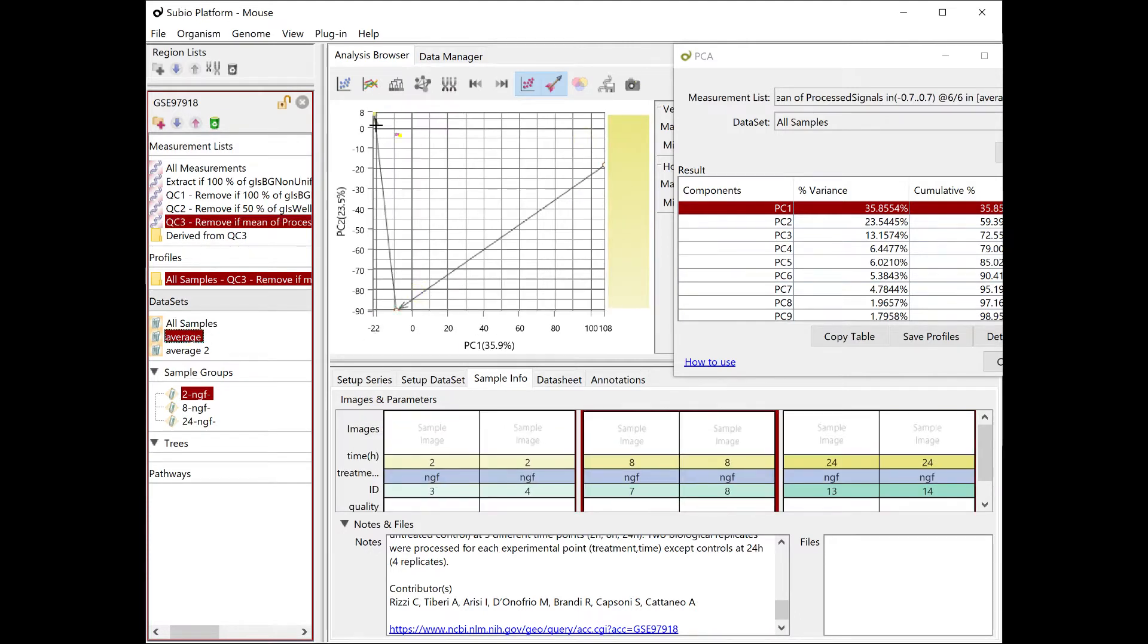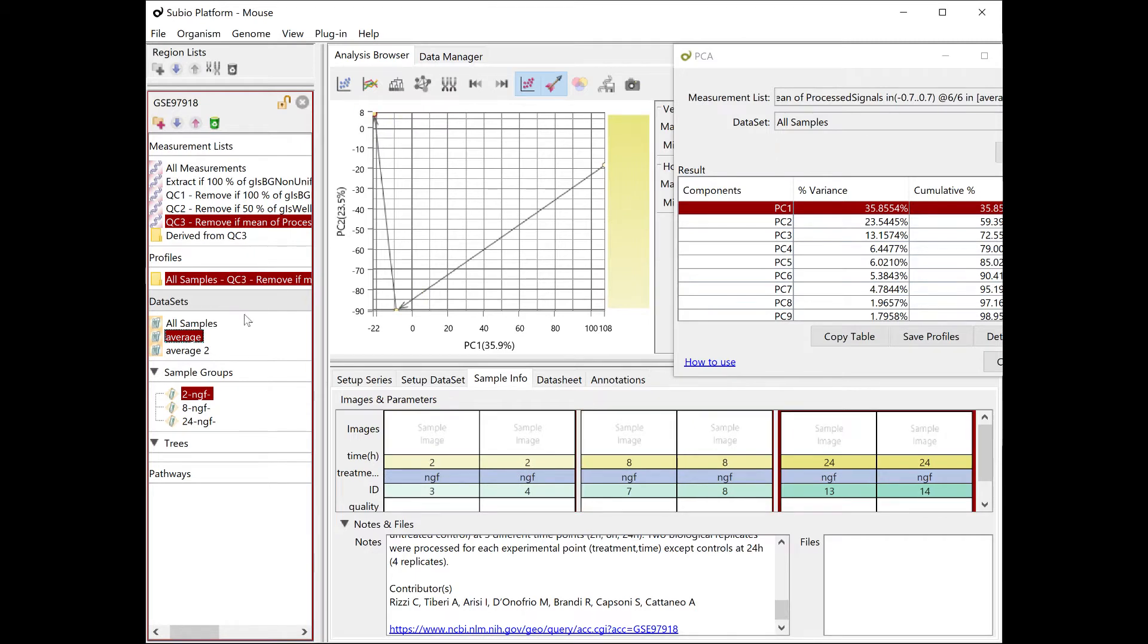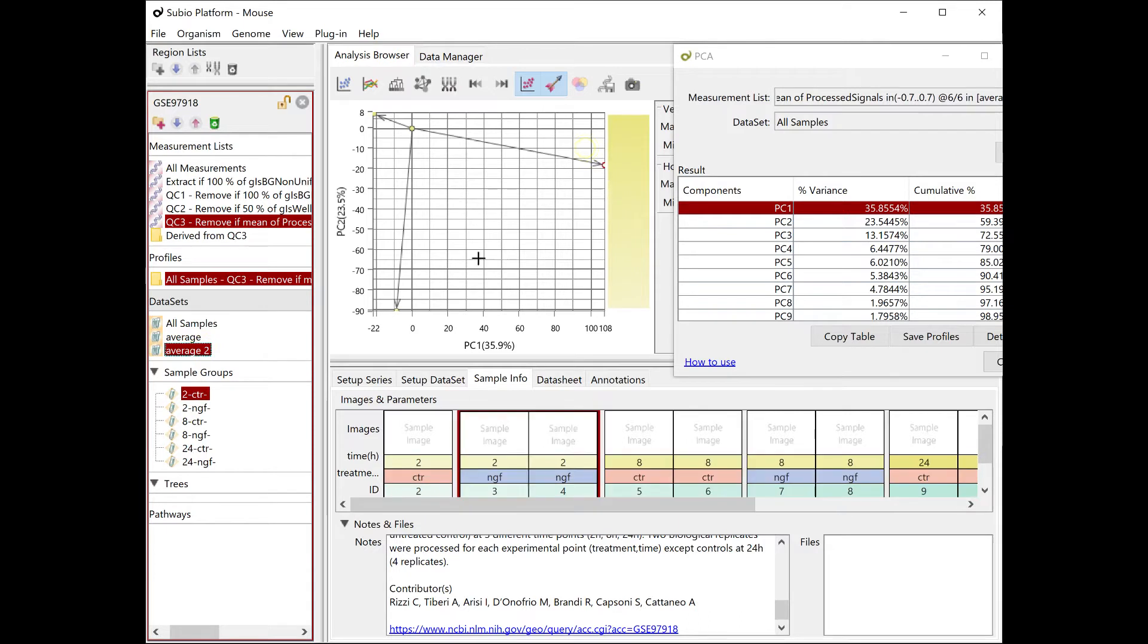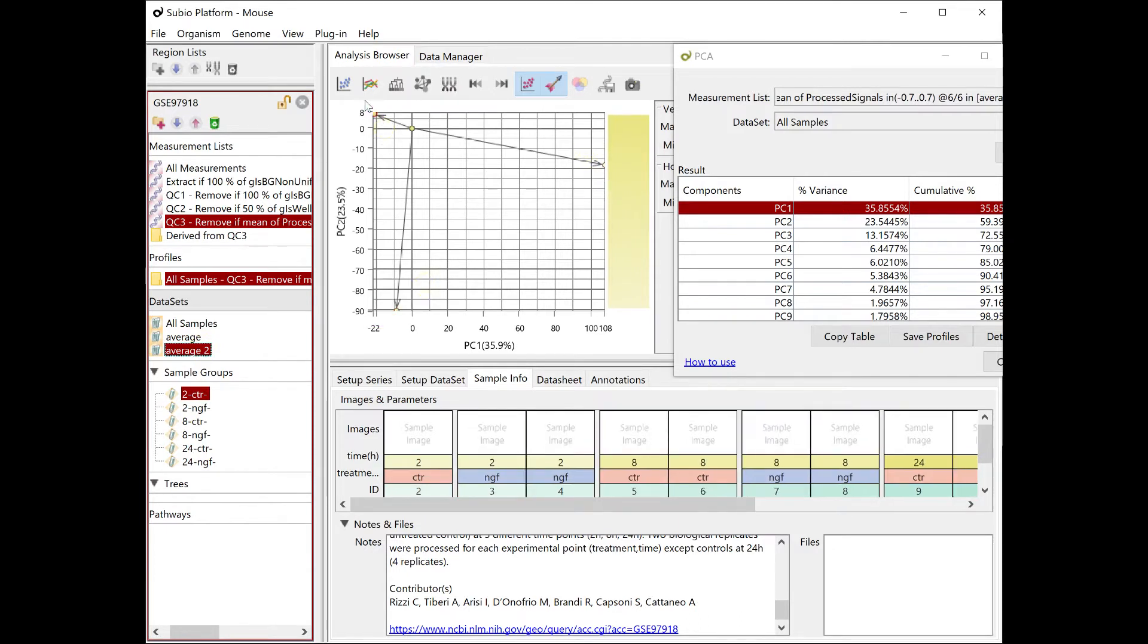If you select the average dataset, the chart visualizes the average expression profiles of two, eight, and twenty-four hours after NGF treatment.